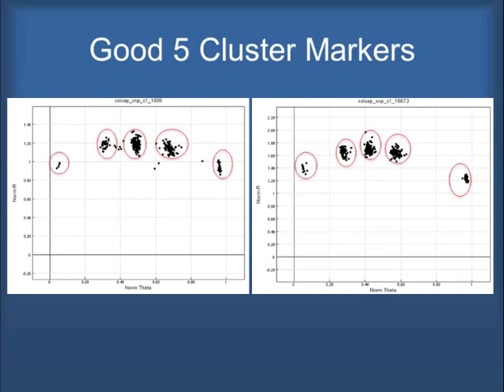So Candy-Hansey, in looking at the data coming out of SOLCAP, we have the russet mapping population, plus we also have some tetraploid genotypes in the panel, has been able to look at the data from a tetraploid point of view. And so here is a nice situation where we have the 5 good clusters to work with.